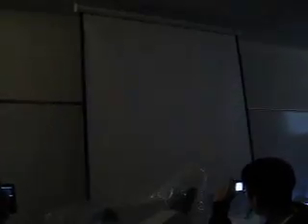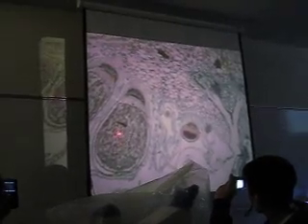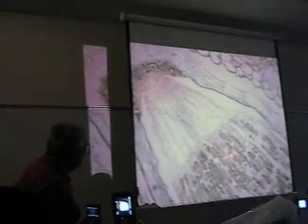The next one — see, this is all garbage here, so don't just focus in on that. Hunt around until you find good tetrads. This one is good, that one's bad, this one's good. Here you can see the foot, the seta, and inside are the tetrads under 10x power. Under 40x you might see the walls a little blurry. But those are the tetrads, and the long stringy things are elators.